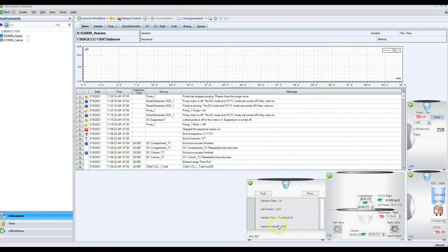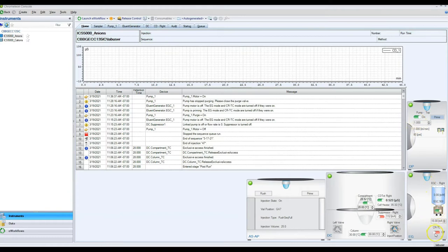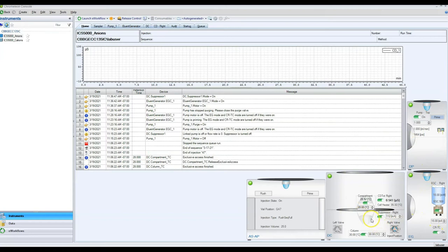The figures on the home screen control the main settings for the instrument: flow rate, eluent concentration, and suppressor current. These are the three most important settings. For the most part, everyone is going to be running with the same settings. For anions, we set the flow rate to 1 mL per minute, eluent concentration to 15 mM, and suppressor to 112 mA.